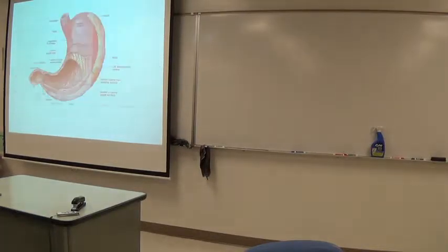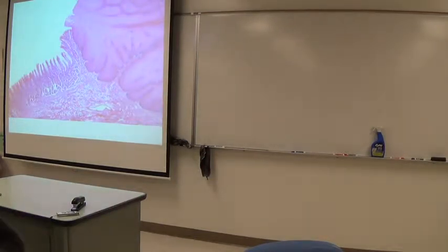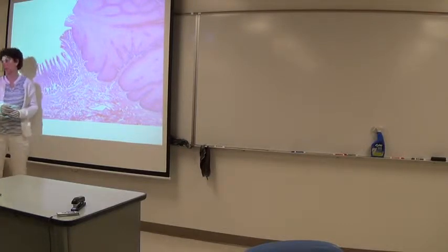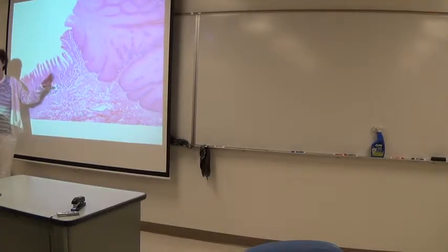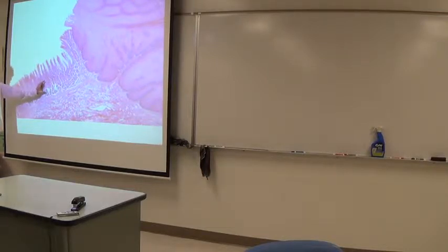All right. We went through stomach. Oh, here's the, I hadn't shown these yet either. Remember we talked about the junctions? There's an abrupt transition from the esophageal epithelium of its mucosa to the gastric. Though it's low power, you can see a distinct difference between the stratified squamous and this simple columnar. You probably can't see individual columnar cells. Point of awareness, these are the gastric pits and the gastric glands.